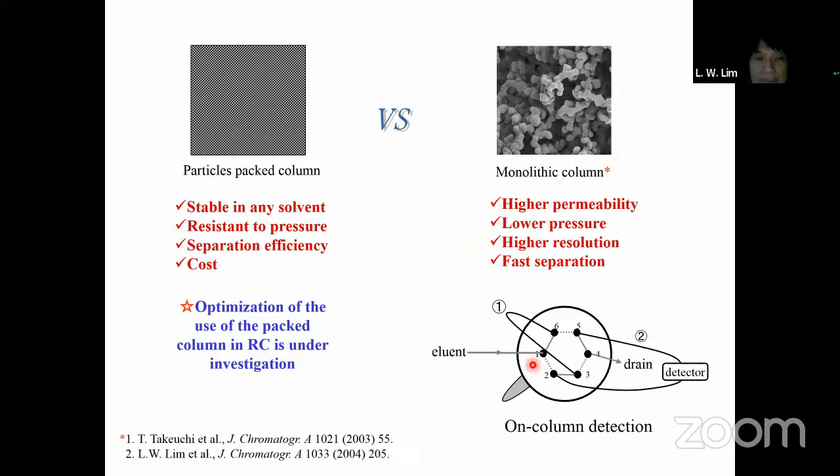C18, lipophilic. So when it's lipophilic, then you have to choose the solvent, like I said just now. You can still use C18, but you have to use a very good solvent so that when the sample separates through the C18, the solvent or the eluent will clean your column at the same time.